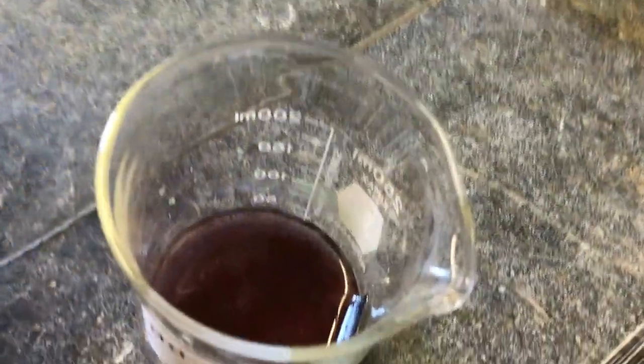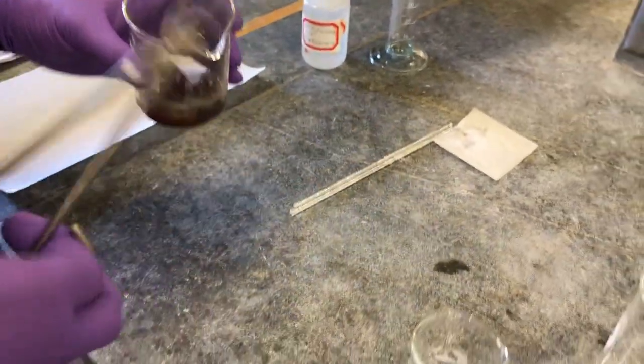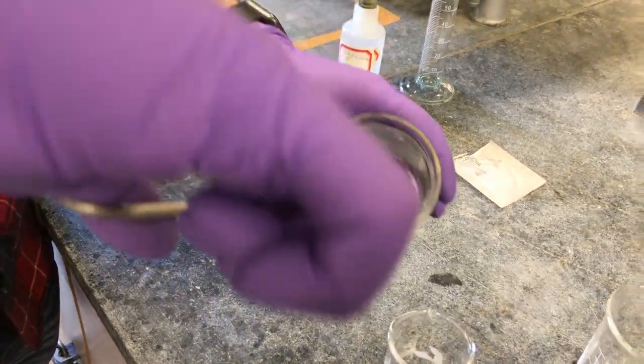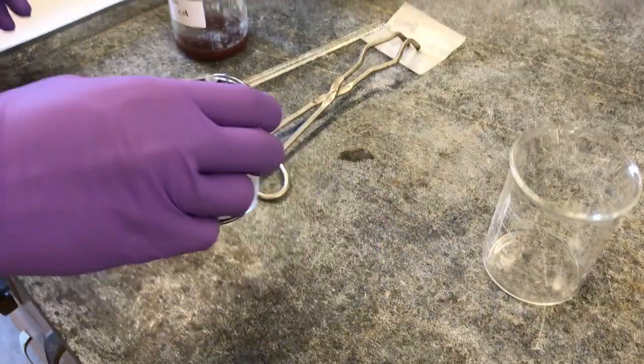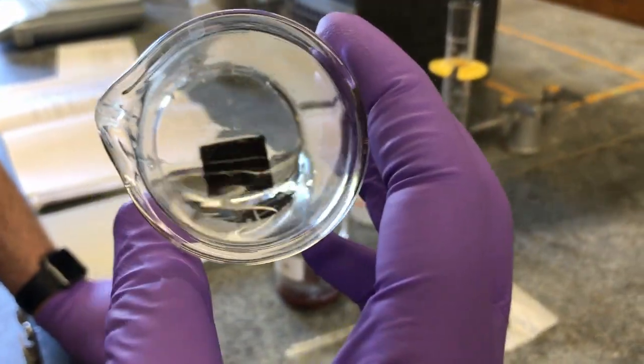So what we're going to do is remove the zinc. And actually, we're going to put the zinc in this beaker of just distilled water to wash off any excess copper pieces. So notice that there's maybe some small chunks there at the bottom.